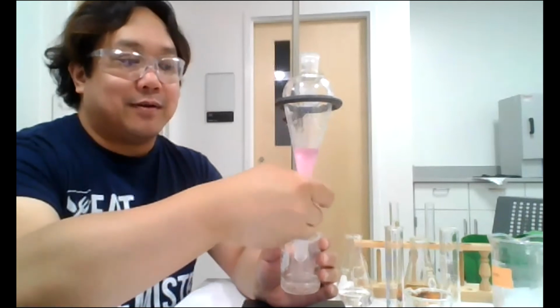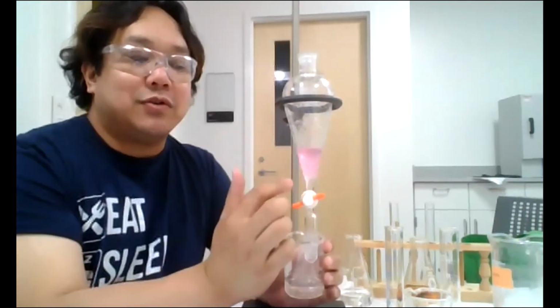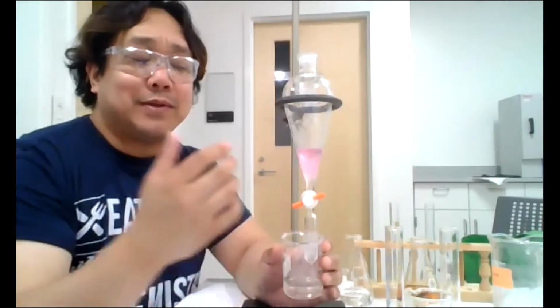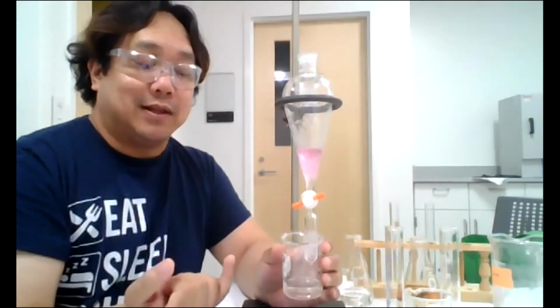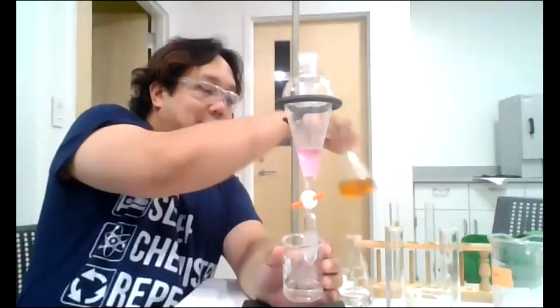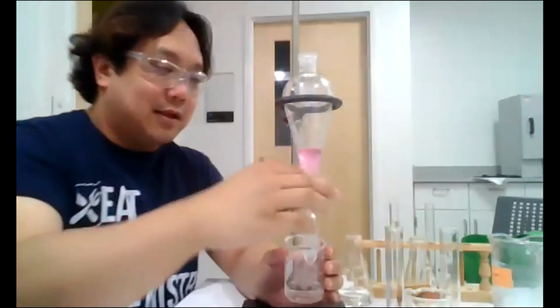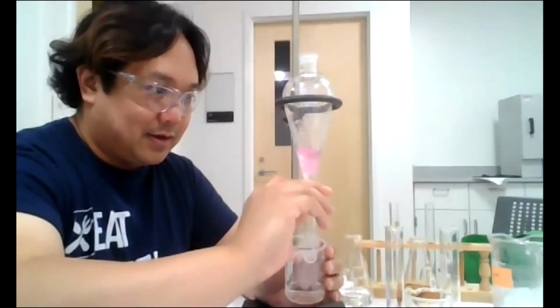If you think about it, before I move on, approximately how much aqueous layer should I have? Remember, we started out with 20 milliliters of the aqueous layer. All right.